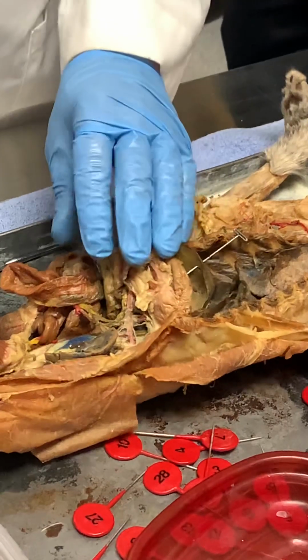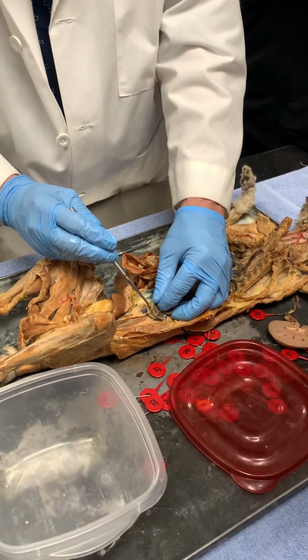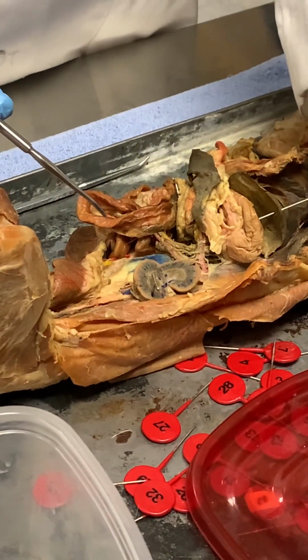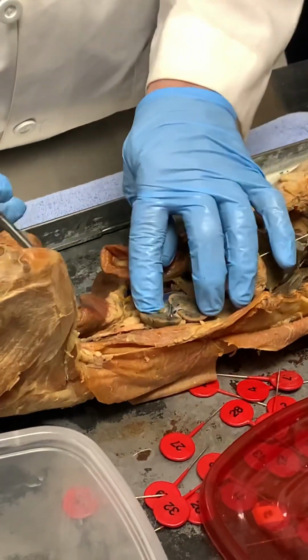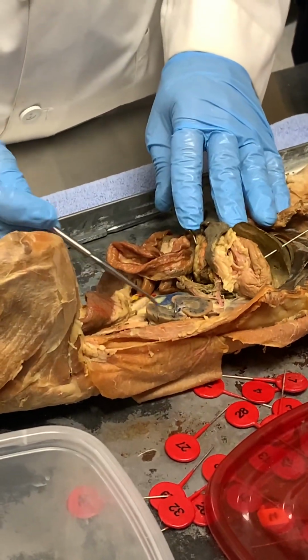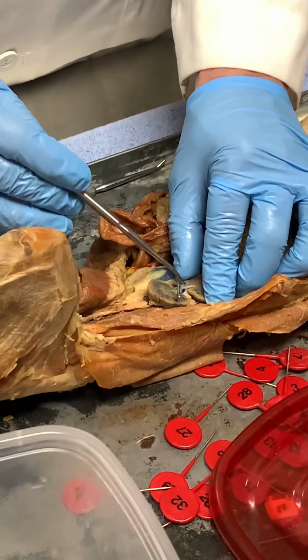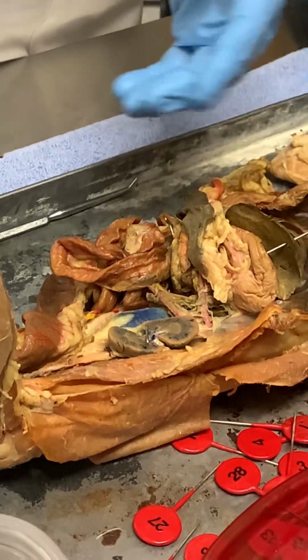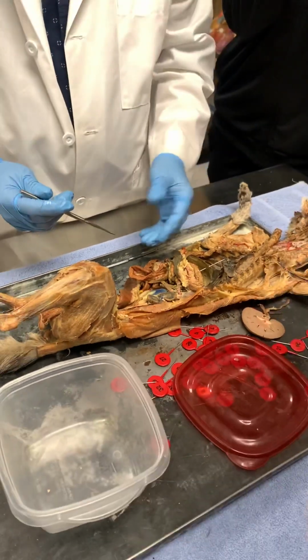The renal capsule is better seen on the cat. It's right here. Just the outside. Yeah, it's just this protective outside layer. And this, I could pin this as cortex. This would be medulla. This would be hilum. I would give you a clue. I would say, is this a layer or a landmark? And often there's more than one correct answer.